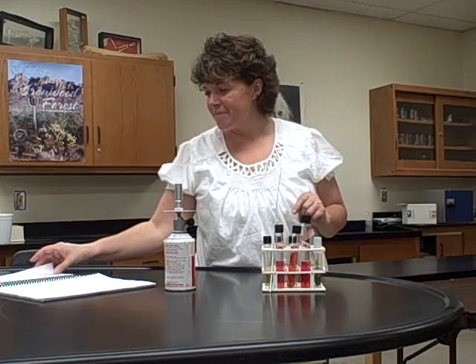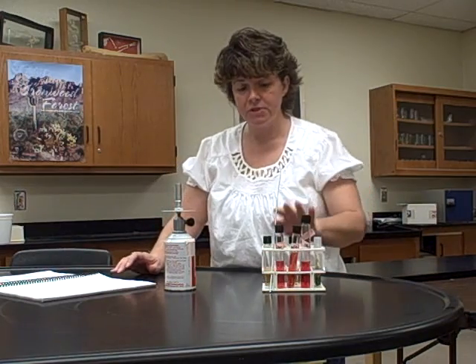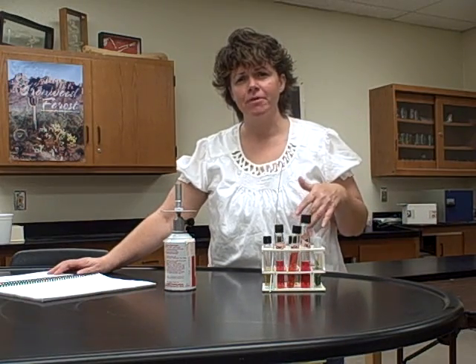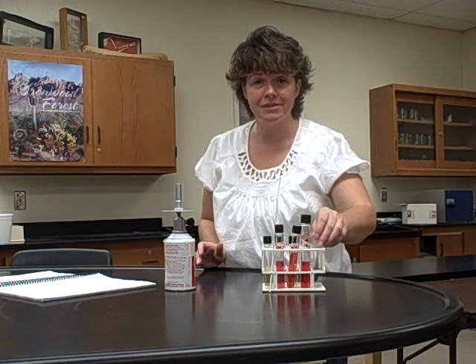All right, one thing I want to add is this procedure starts on page 93. It has the fermentation tubes and the MRVP tubes. I'm going to add one tube that was in a previous edition of the book, and I like to use it now because we're going to use it later, so it won't be sneaking up on you later in the semester. The last tube that we're going to use is called the Simmons citrate tube.